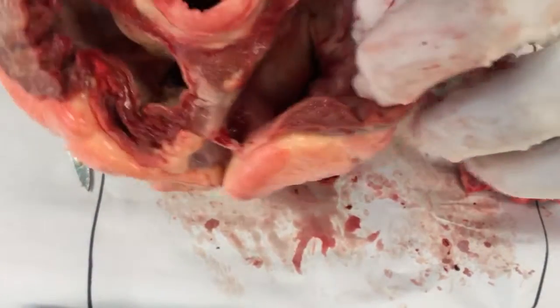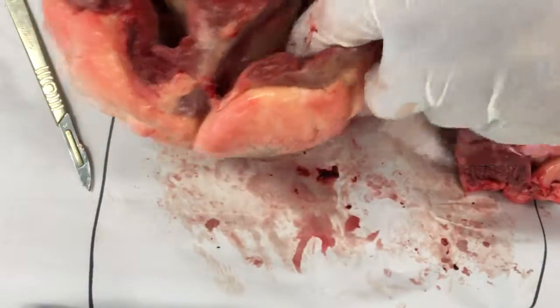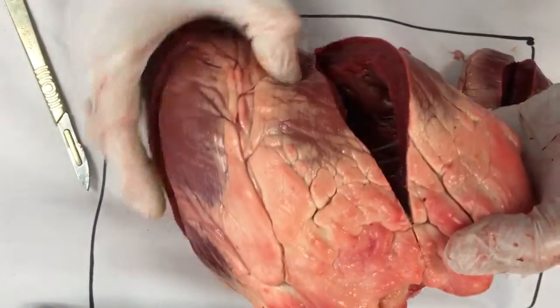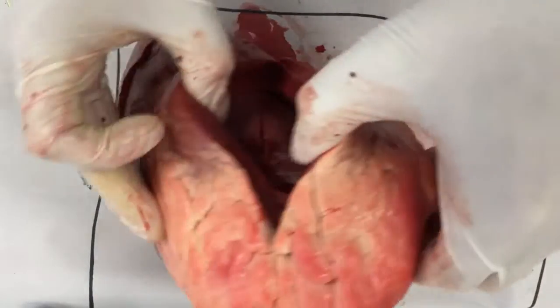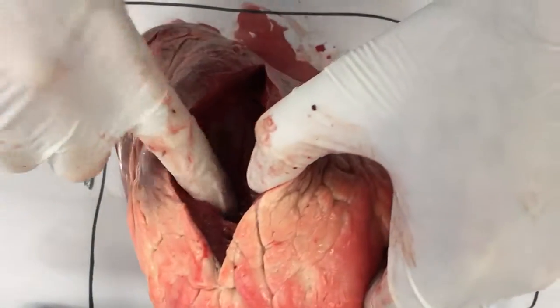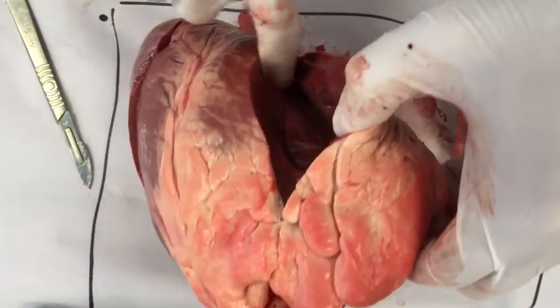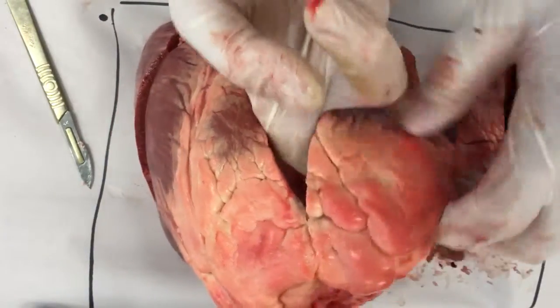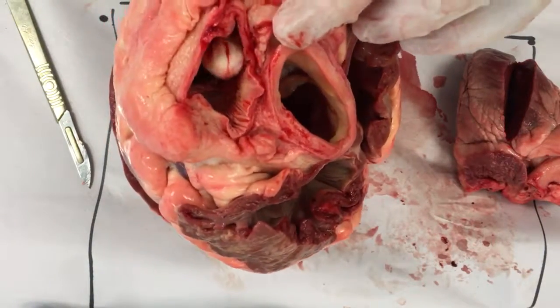It fills up this bit at the back, which is the right atrium. Then it goes down — you can see the tissues here, the valves go right into this, which is the right ventricle. Then it goes up to the top and out through here, through the pulmonary artery.